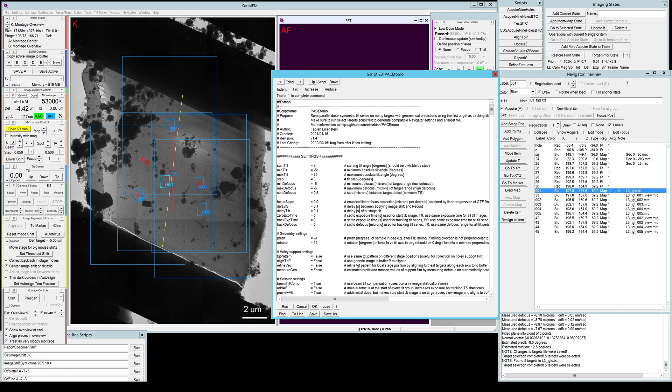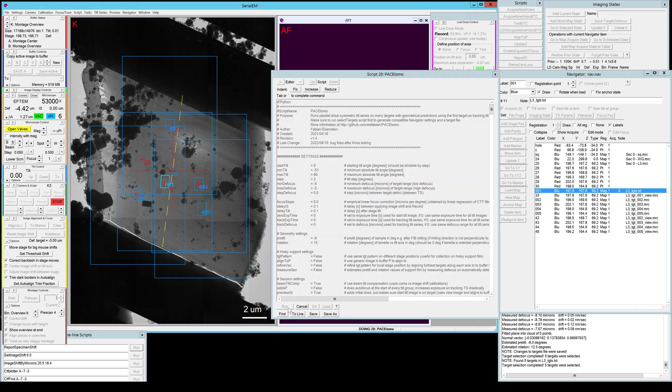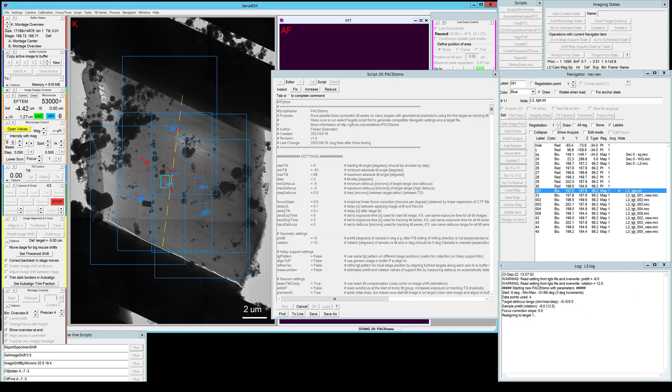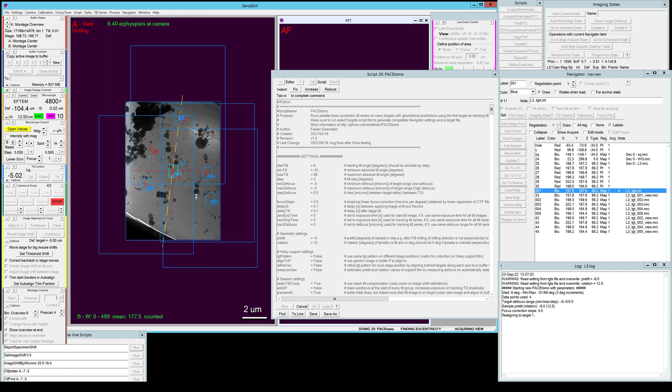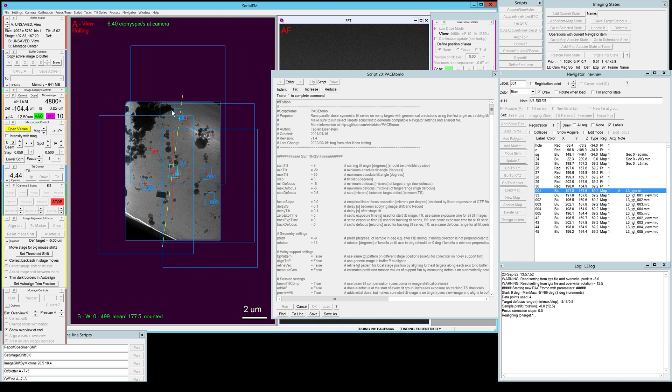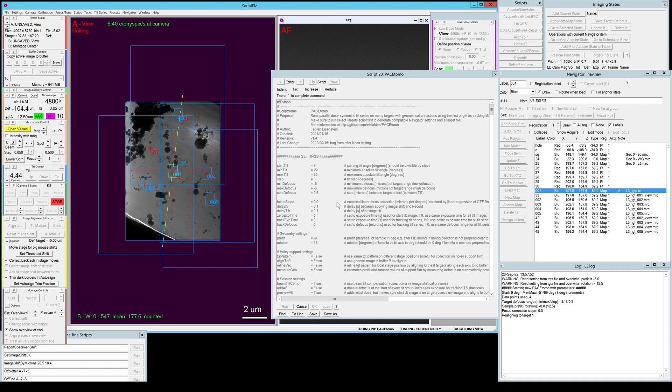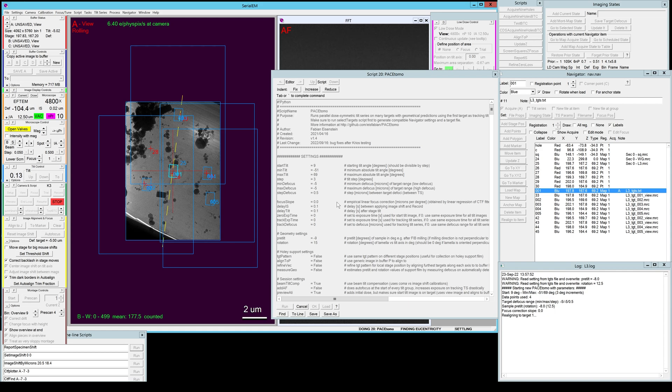Now the only thing left to do is, as I said, select the first target of your PaceTomo run and click run. It will open a new log window. It will put out some of the settings here. For example, it will warn you that it read from the settings file a pre-tilt and a rotation value and it will overwrite whatever you put in the script. And then it will go ahead, realign to the first target, do a rough eucentricity routine, do an autofocus, tilt to the start angle, align all the targets again, and then just collect. So let's speed things up and have a look at how it goes.